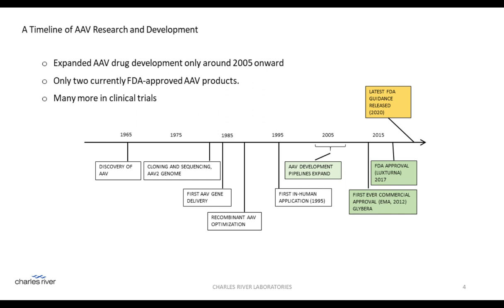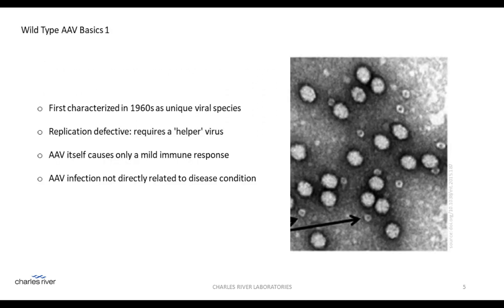In this talk, we'll discuss, and importantly show data also, in particular how recent advances in AUC characterization of AAV products may help inform that type of guidance.